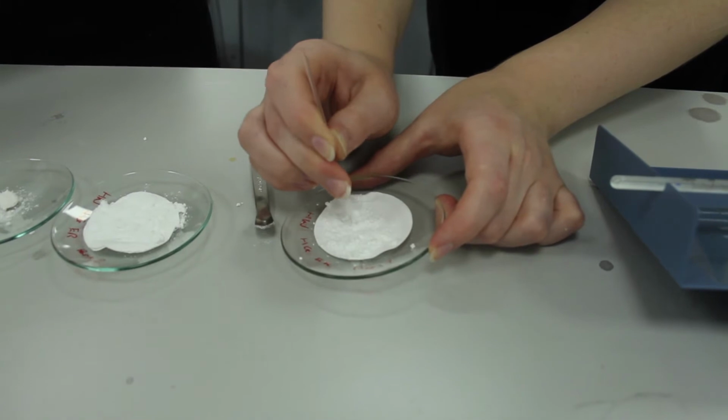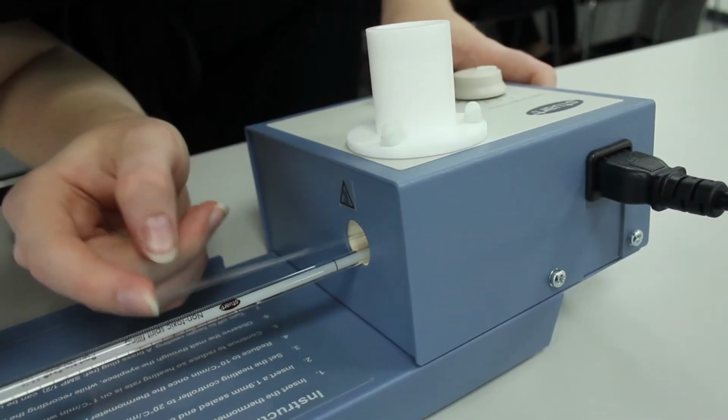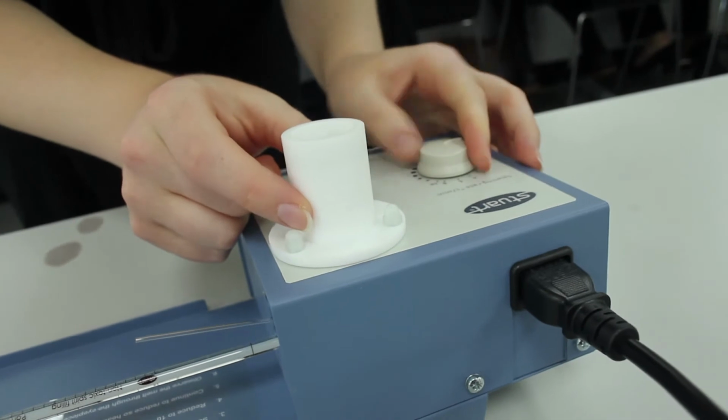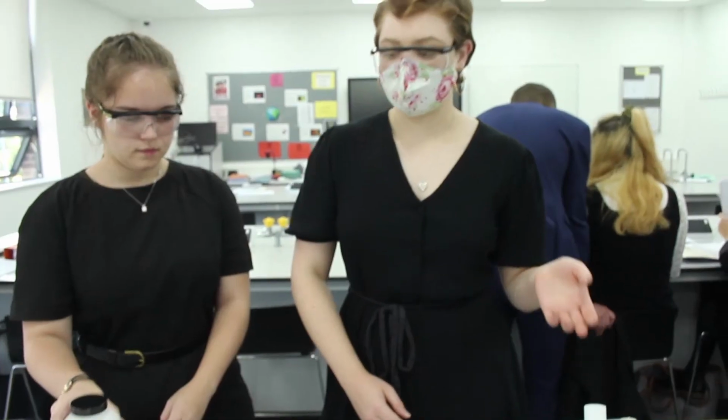We're doing melting point determination after we've created the samples in the original experiment. So it's just testing the purity of the things we made. So we're using the melting point determining apparatus and then seeing the range at which it melts, and if it melts within the parameters, which is 138 to 140 degrees, we know it's a pure sample of aspirin.